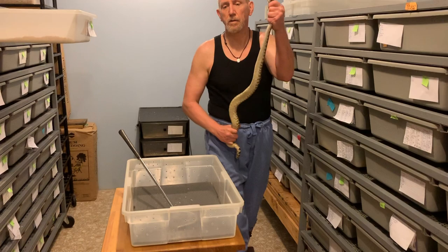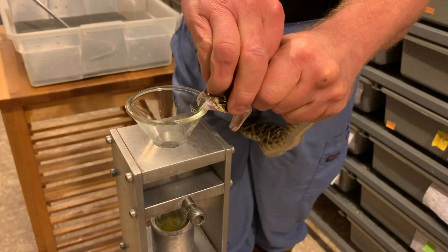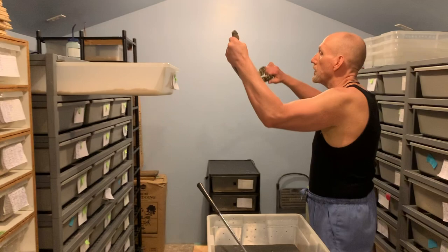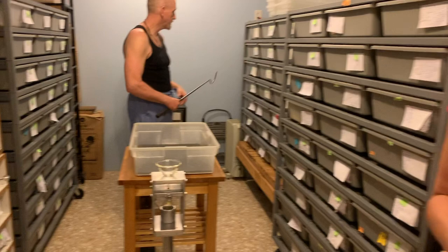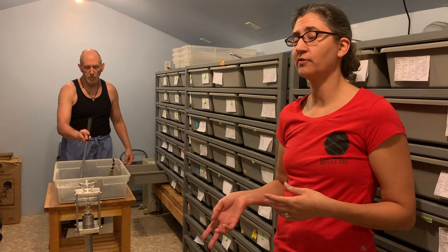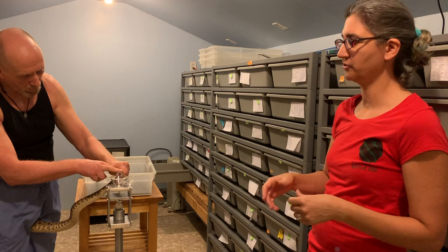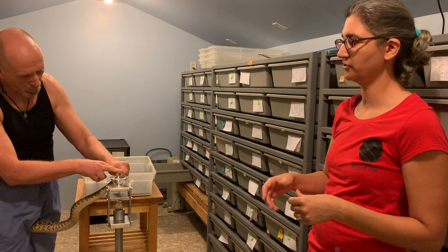If you all have any questions that I haven't answered, you can put them in the comments and we'll try to answer them for you. These snakes are from 2016, so they are four years old. How do you know when to start them on extraction? We typically wait until snakes are about two years old to start extracting — it varies some depending on the species, but it's based on when that species would typically reach sexual maturity. We can extract from juveniles, and sometimes researchers actually request that, but for most purposes we're extracting from average adults, which for these guys starts when they're about two years old.